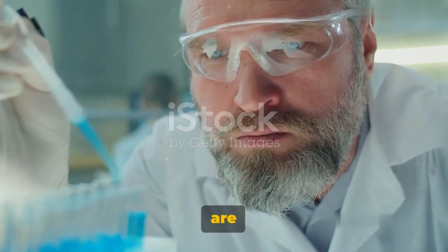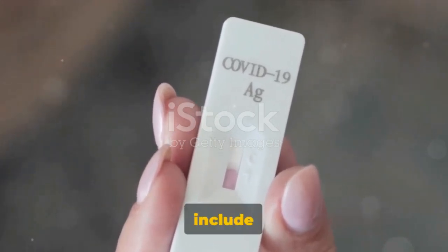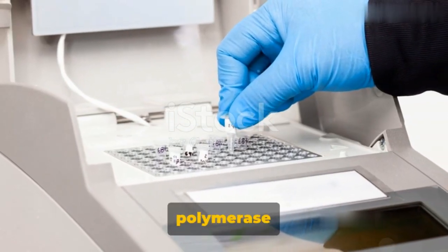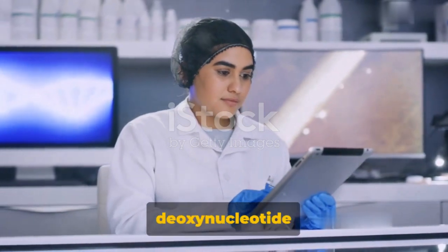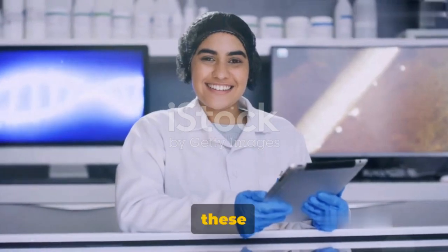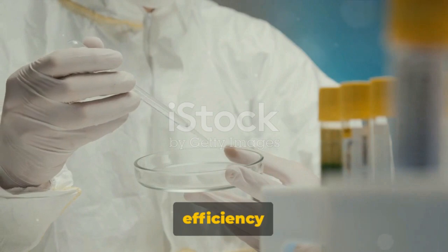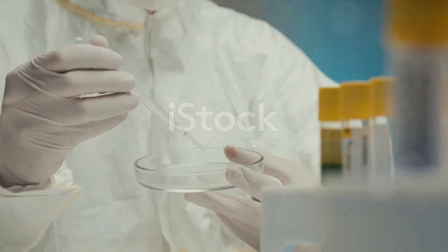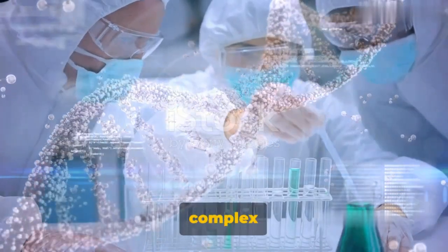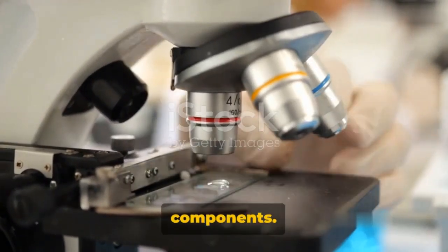What's even more interesting are the 6 key components that make this process possible. These include the nucleic acid sample, reverse transcriptase enzyme, DNA polymerase enzyme, primers, deoxynucleotide triphosphates, and PCR buffers. Each of these elements plays a vital role in ensuring the accuracy and efficiency of the RT-PCR process. But what exactly do they do? How do they contribute to this complex process? Now, let's delve deeper into each of these components.